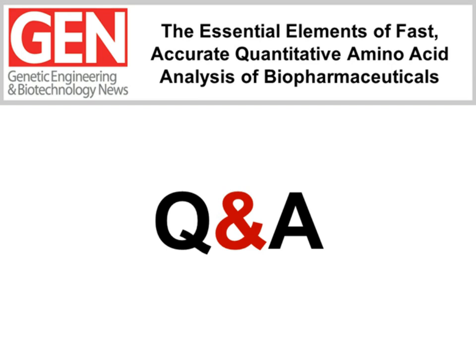We can then extrapolate the threonine, serine, and tyrosine amounts to a 0 time to account for the destruction, and extrapolate usually isoleucine and valine to a stable time. We look for the amounts to stabilize to get the best analysis for that. So it's a very long answer to a very short question.